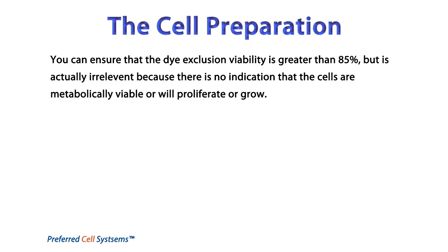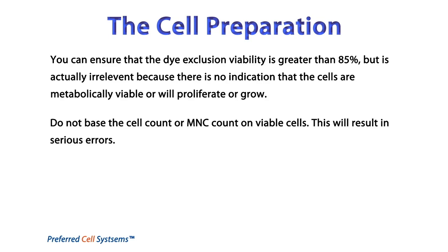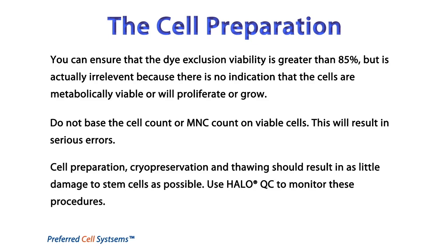Halo SC-IPS is based on the ability of cells to produce intracellular ATP in their mitochondria and is therefore a metabolic viability assay. Please also be sure not to base the MNC count on viable cells, as this can result in serious errors. Measure the MNC count directly and perform all cell concentration adjustments on this MNC count. Make sure that your cryopreservation and thawing protocols result in as little damage to the stem cells as possible. This can be monitored using the Halo QC assay kit.